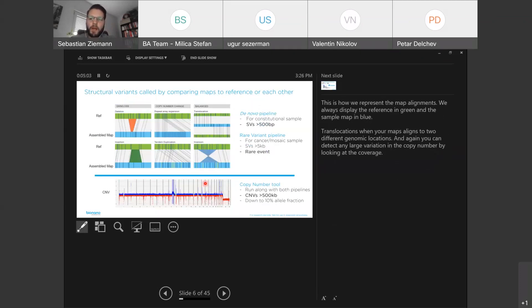This is how we represent map alignments. We always display the optical map — the assembled map from the sample — in blue, and the reference is always in green. We can detect any gains and losses higher than 500 base pairs. If the distance between labels is shrinking, you have a deletion; the other way around, you have an insertion. We can also detect copy number variants like repeat array expansions, tandem duplications, translocations when your maps align to two different genomic locations, and inversions.